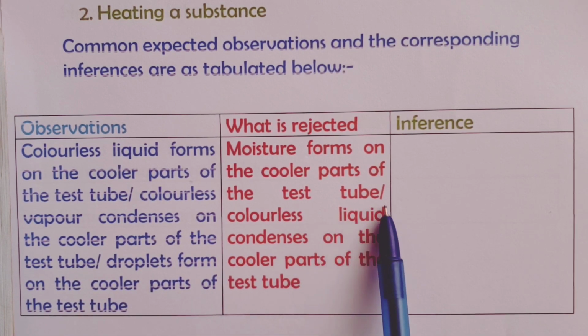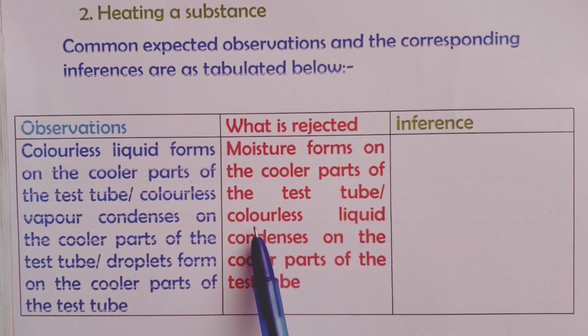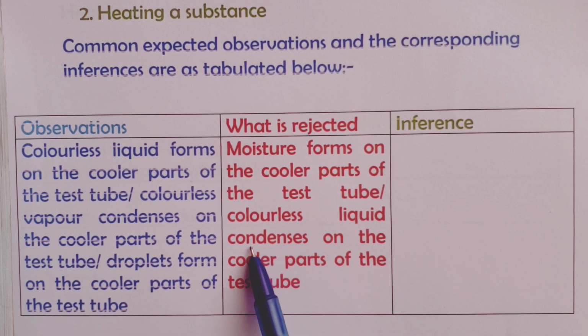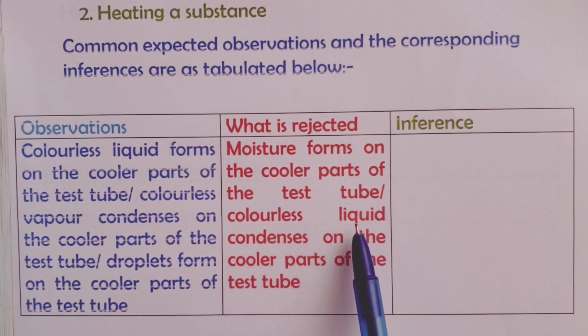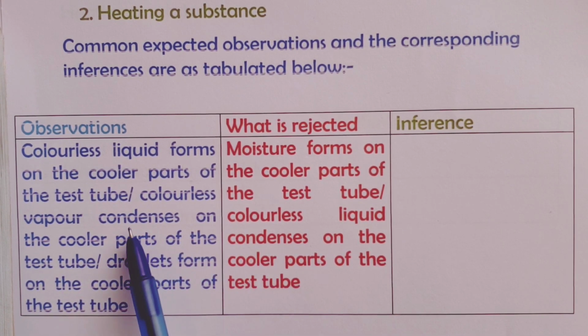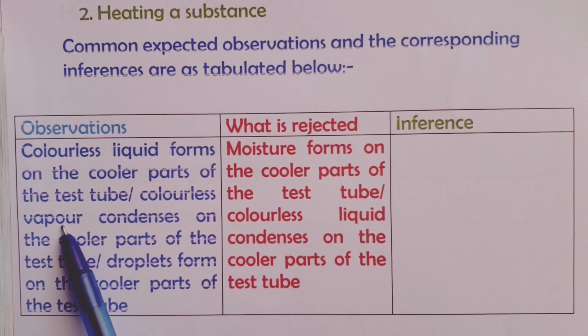Other candidates also talk about colorless liquid condenses on the cooler parts of the test tube. This is chemically wrong. Liquids don't condense. It is vapor that condenses.